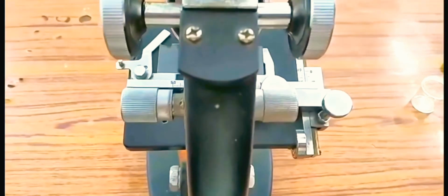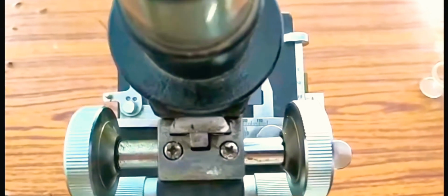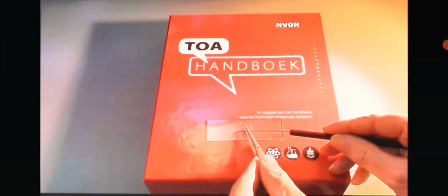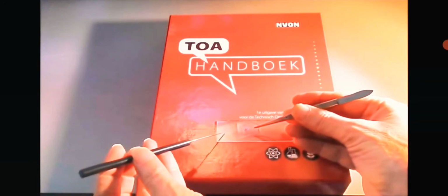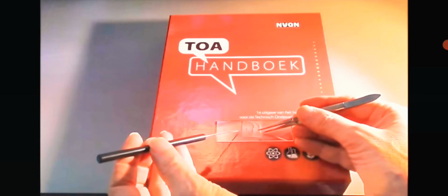So the question arises, why are we selecting the Rhoeo leaf and not any other green leaves? The reason is, students, we have to see the plasmolysed cell under the microscope. In that observation, the chlorophyll will create hindrance in observing the cellular structure. That is why we are selecting the purplish epidermal layer of the Rhoeo leaf, so that we can easily see the cells under the microscope.